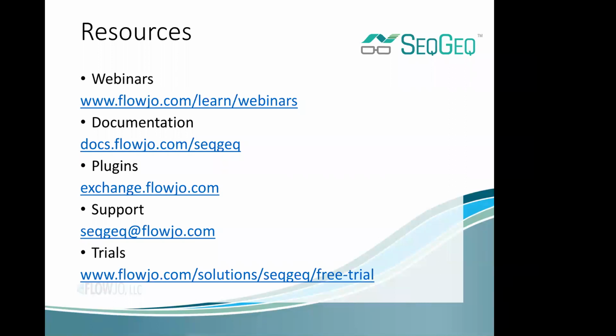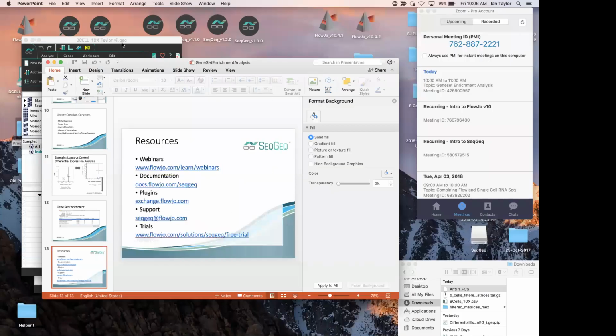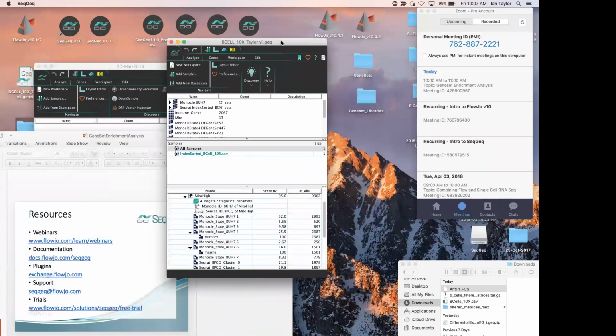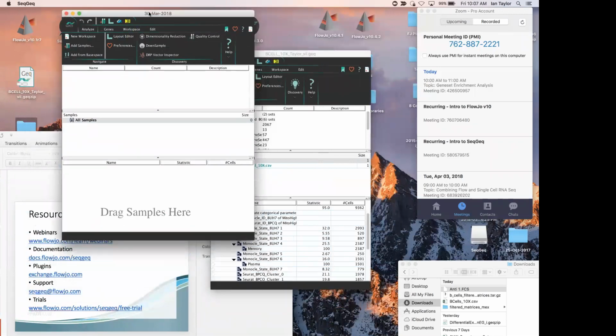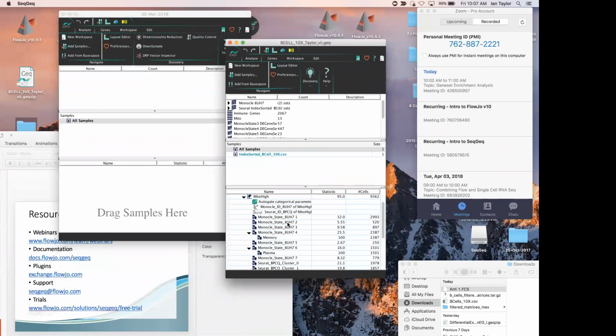For the last bit of this demo, I would just like to walk through some GeneSet enrichment analysis with you live here. So I'll leave these links open in case anybody's still writing those down. Now would be a great time. If you have questions, feel free to post them into chat or save them and send me an email afterwards.